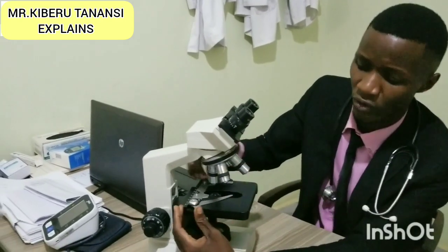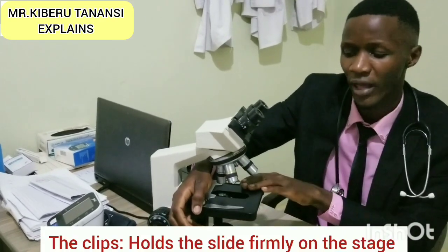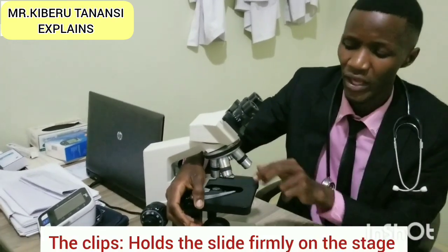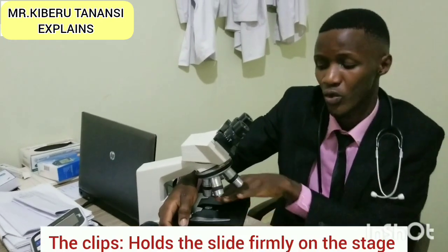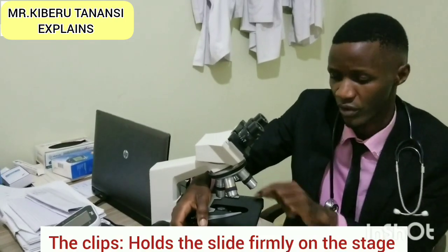From there, on the stage, we have these clips. This one is a clip. The clip holds the specimen onto this stage. So if we put our object here, you have to use these clips or this clip to hold that object very firmly onto the stage. So this is the clip. It holds the object on the stage.